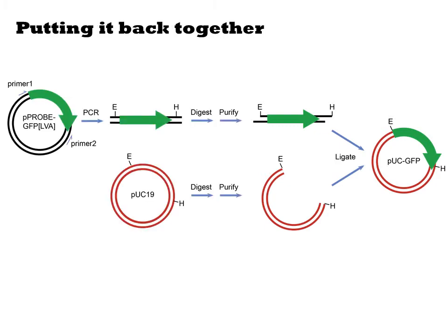A construction file is basically a formal way of expressing a cloning experiment. Minimally, it allows you to explain precisely to your computer the experimental plan for documentation. Also, simulating construction files helps catch design errors and thus saves time in the lab. Best of all, software can automate the drafting of construction files for simple experiments.